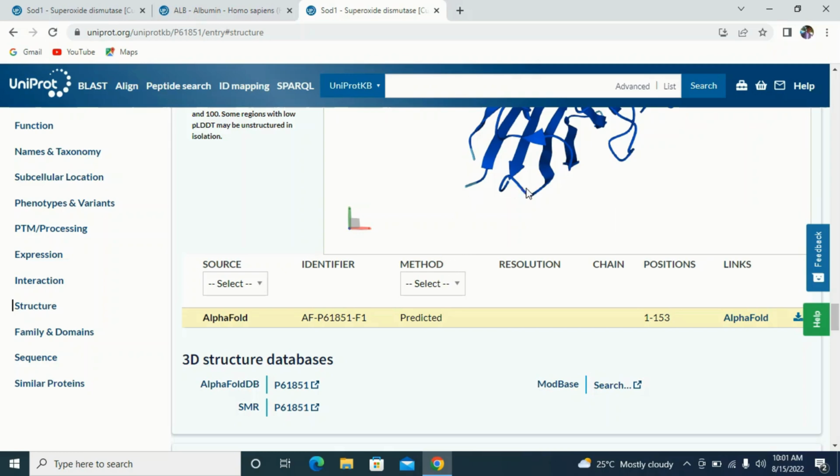From what you can see, this is simply a predicted structure, or what we call a model. Somebody has modeled this before and uploaded his or her modeled result. So this is not actually an X-ray structure. As a result, I may decide not to use this predicted structure. I need to predict my own and make it meet my own conditions before I can pick it. So this is why I can't use this particular protein. The structure has not been elucidated.